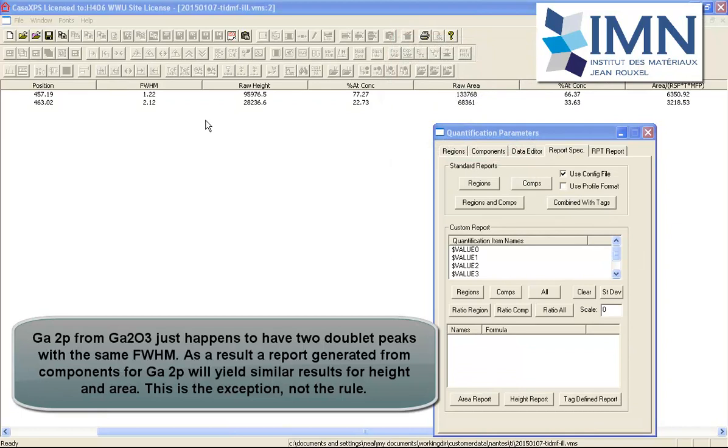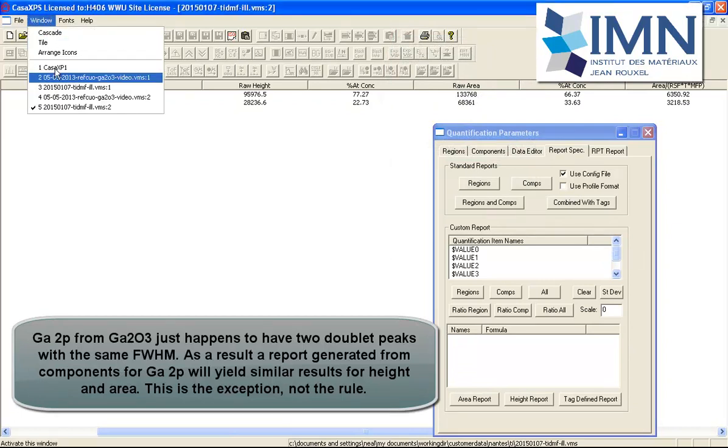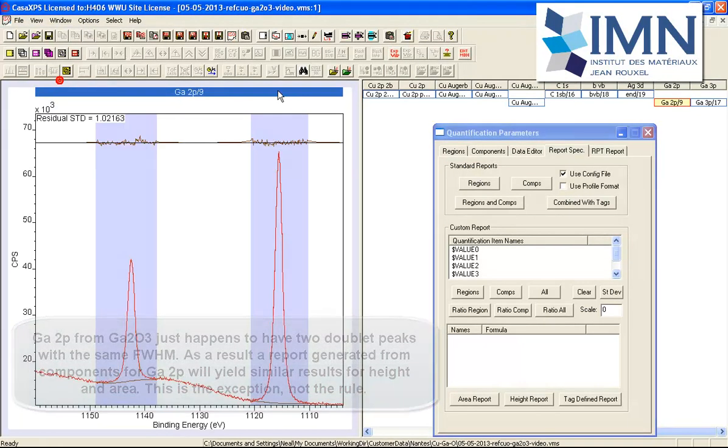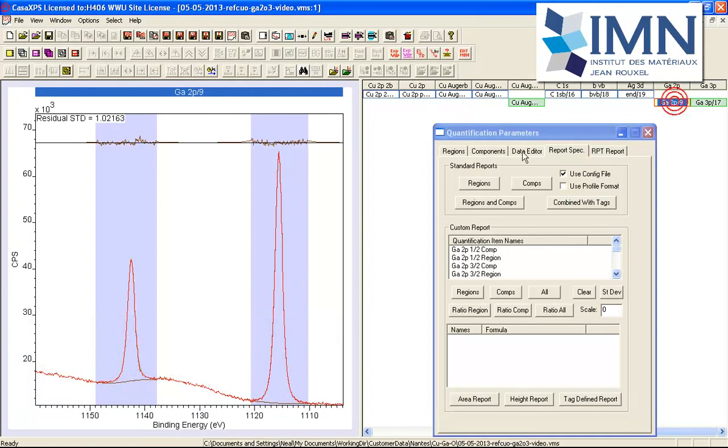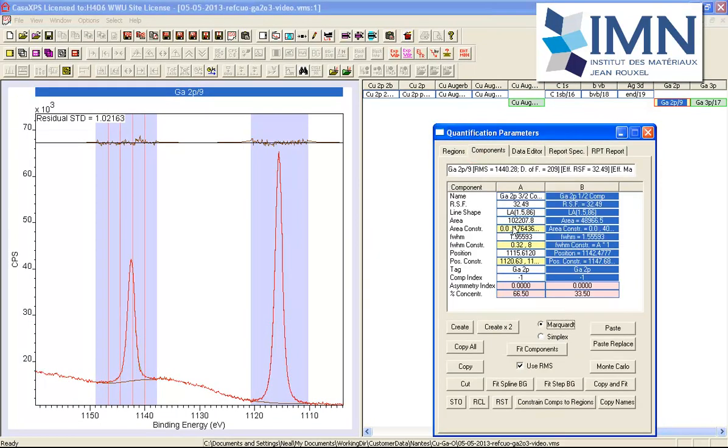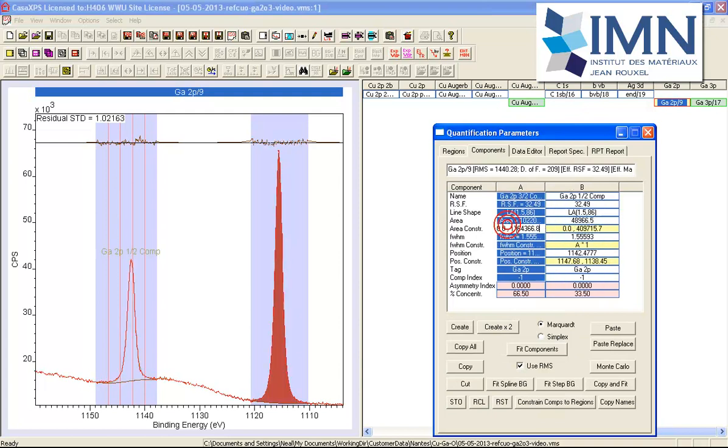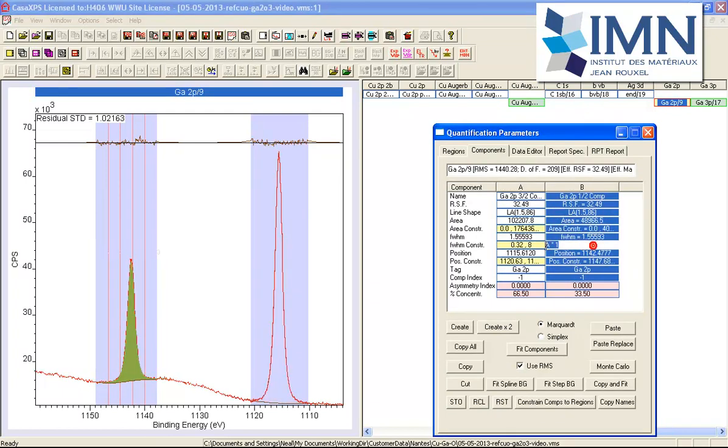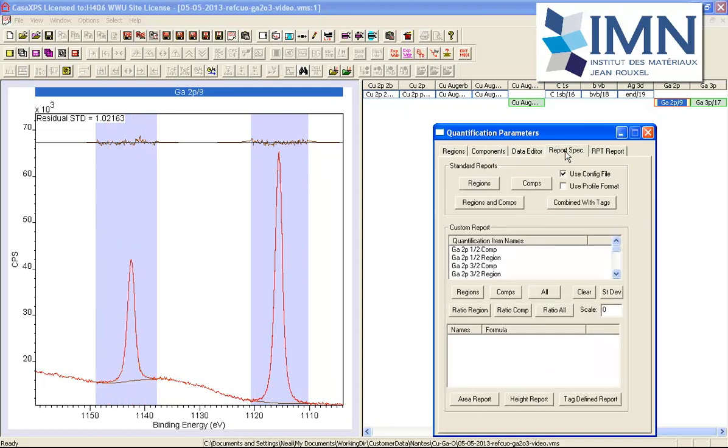So we'll go back to the gallium, and this time we'll use the components on the gallium. You can see that the components are fitting the data very nicely. They have a very similar full width half maxima; I've actually constrained them to be identical.